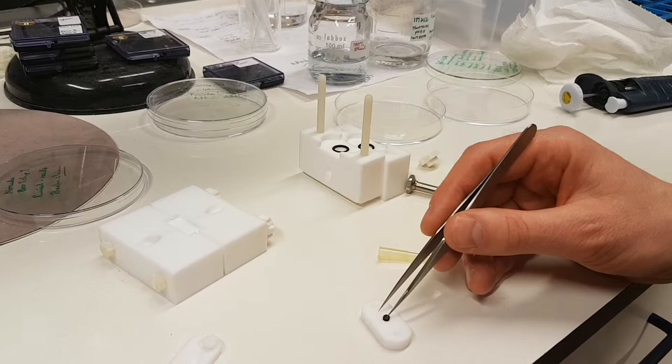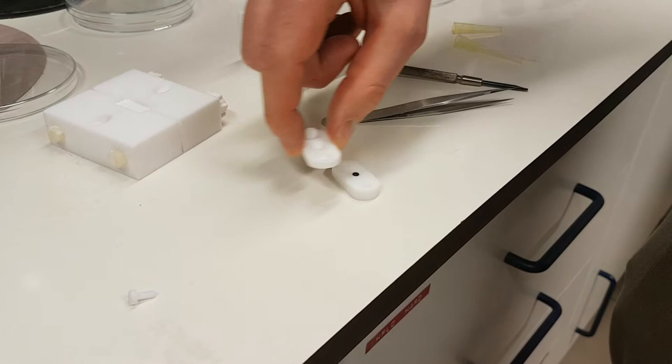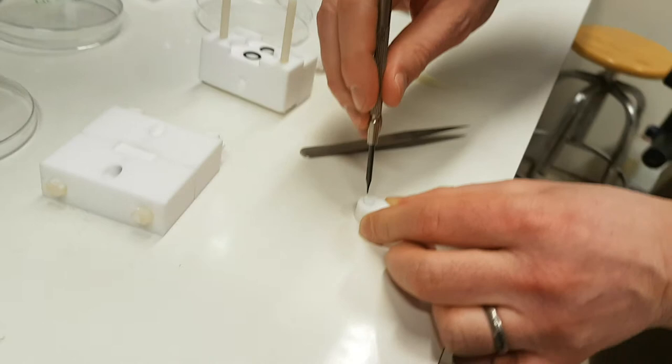What I'll do now is push down, which I've done. So now what I'm going to do is finish constructing the cassette. And it all looks so simple, but the years of engineering that have gone into making all this really easy. There's years of research gone into this.